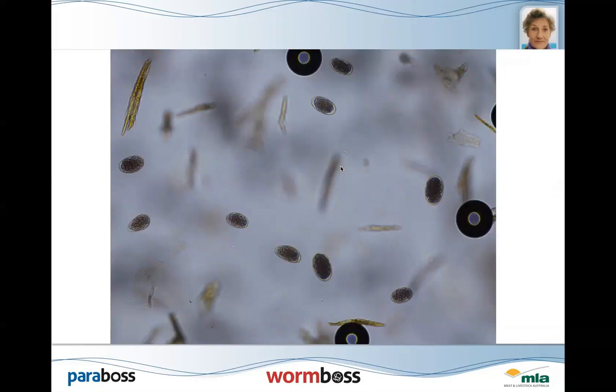This just shows you a couple of things. First of all, these big round black things here, they're air bubbles, and if you can see them really sharply and clearly, you know you're focusing on the right spot, because they rise up under the glass, and so do the worm eggs.